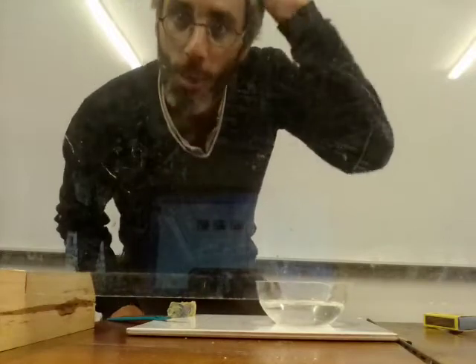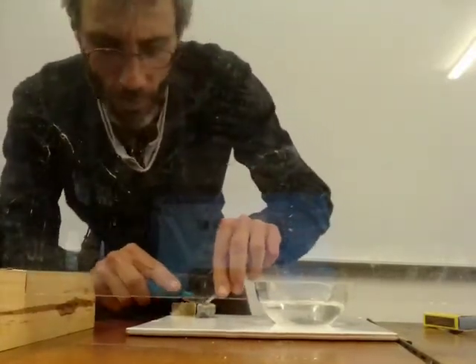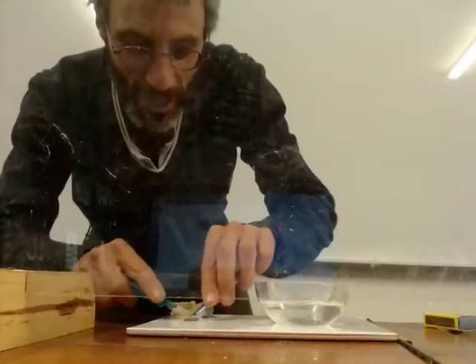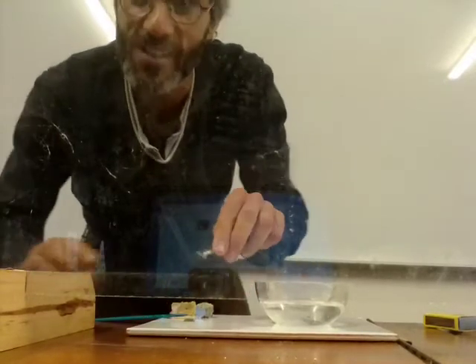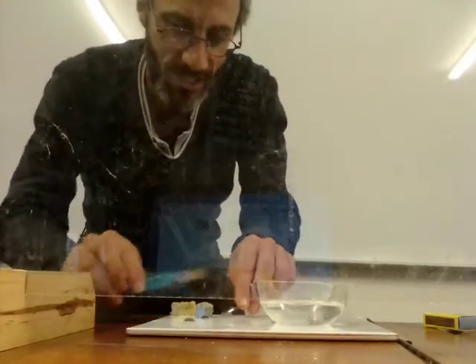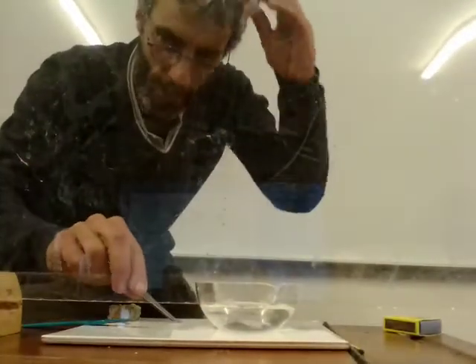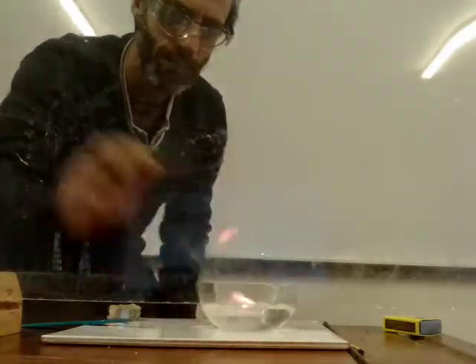Okay, now what we're going to do, we're going to cut some potassium. Potassium, I'll do a little smaller bit, so you'll see in a minute why. Before I do that, I'm going to see if I can bring it a little bit closer. I hope you guys are going to see it. If you don't see it, I will just do it one more time when I'm holding the camera close, okay? Or if you missed that one.